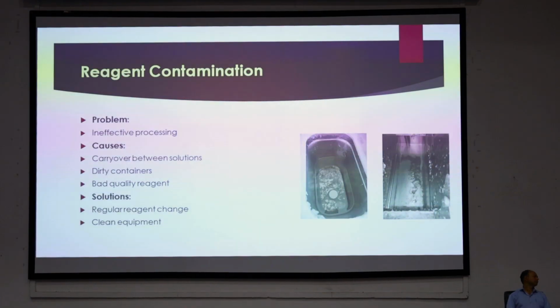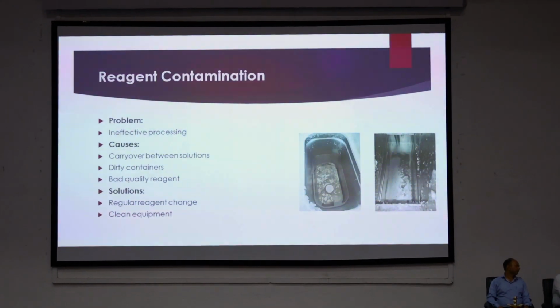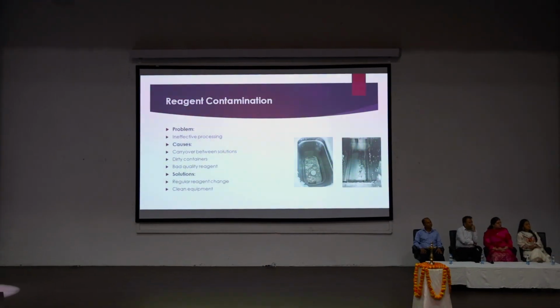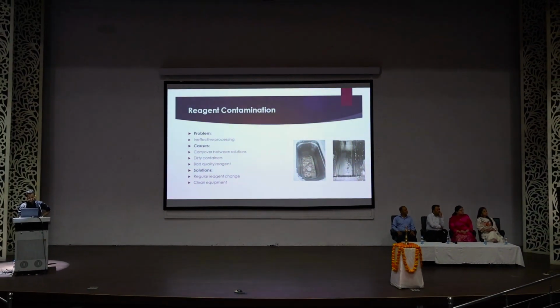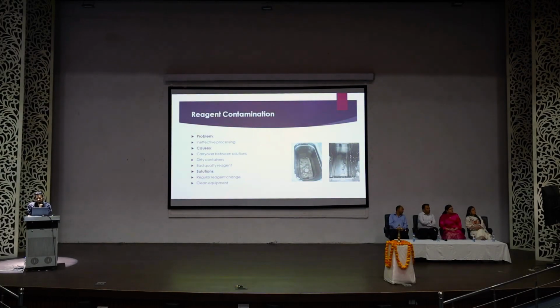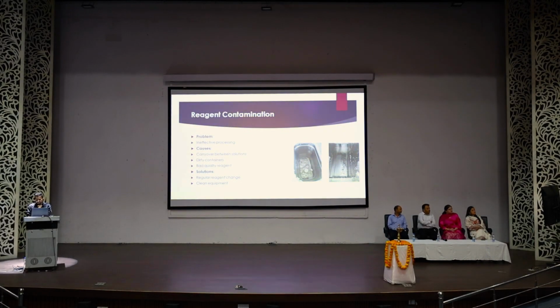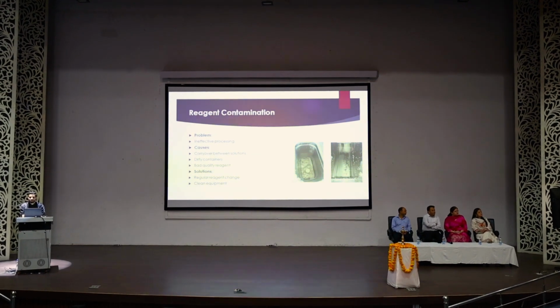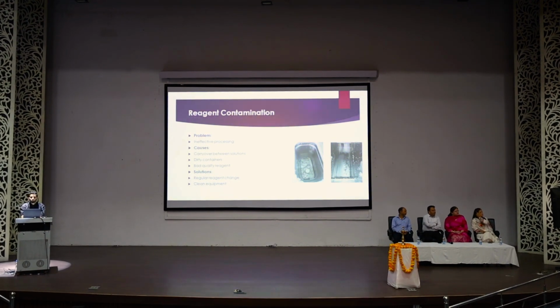Now, reagent contamination. Here the problem is ineffective processing. Causes are carryover between solutions, dirty containers, and bad quality reagent. You need to change reagent regularly and clean the equipment. If you see, these are two wax tanks which became dirty only after consuming bad quality reagent. So you always replace bad quality reagent with good reagents.